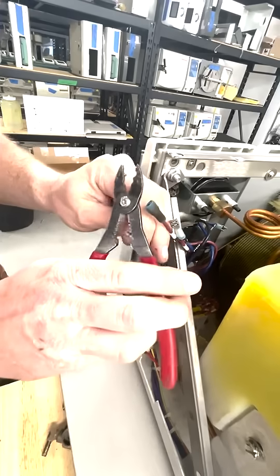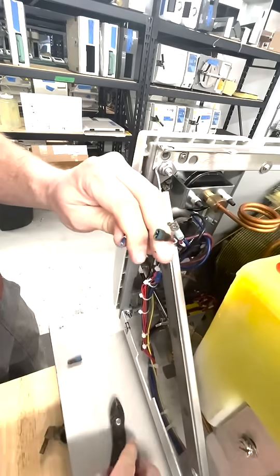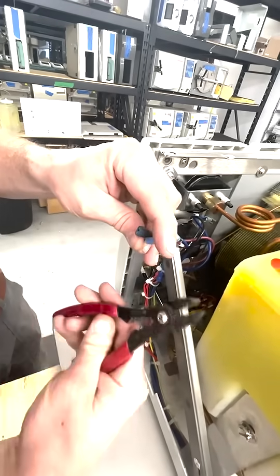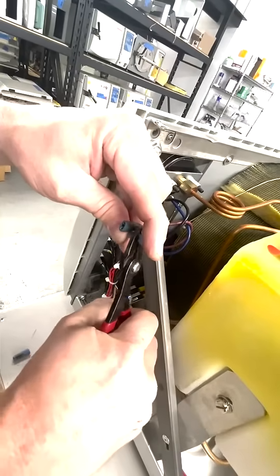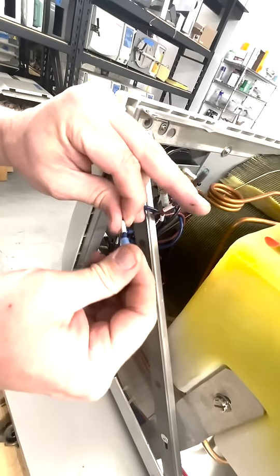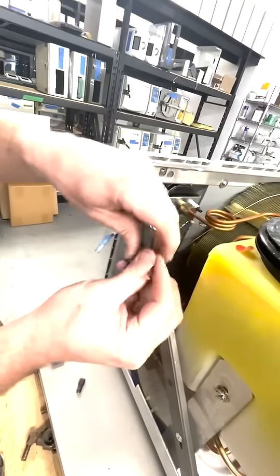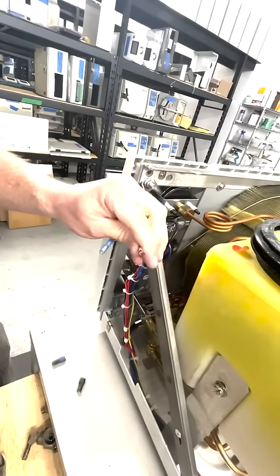Make sure you have the unit unplugged when you're doing all this. I'm going to strip back a little bit of wire. My new spade connector will go on just like so — use my crimpers. Make sure it's nice and tight. Whenever you change one of these, you always want to give it a little tug to make sure it doesn't fall off. This one is charred as well, so cut that back and strip a little bit of wire.